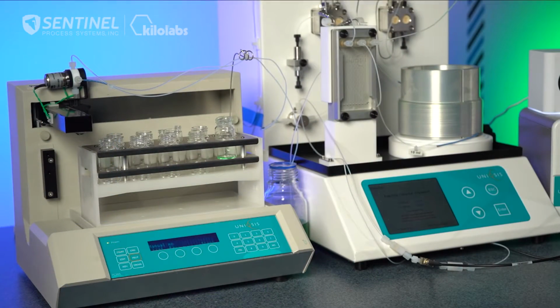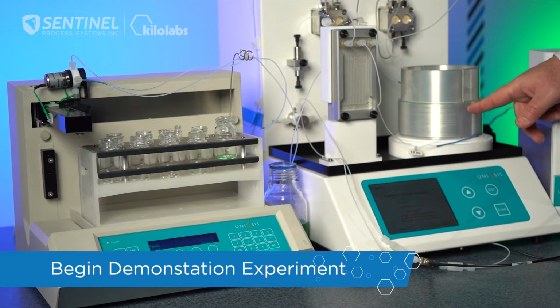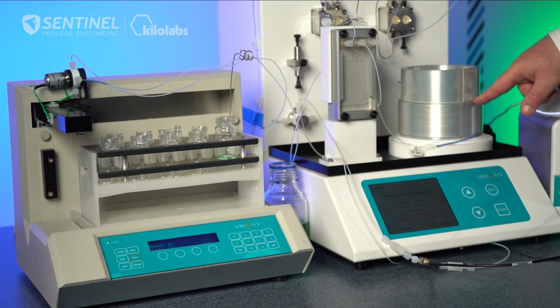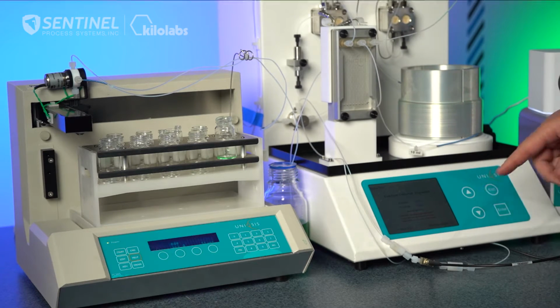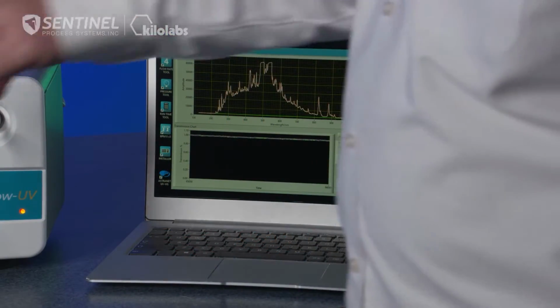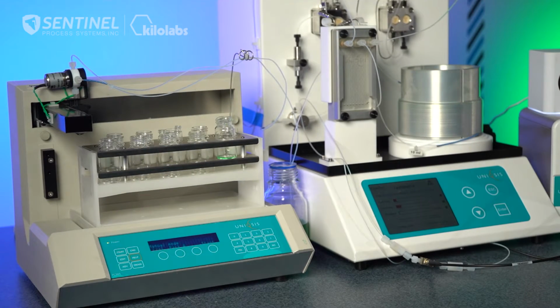All right, we're going to start a flow chemistry experiment using blue and yellow dye to make green through a mixing chip and a coil. And as the green mixture comes out of the coil and goes through the FlowUV cell, we'll be able to see the transmission change on the UV spectrophotometer. So I'll start the experiment.